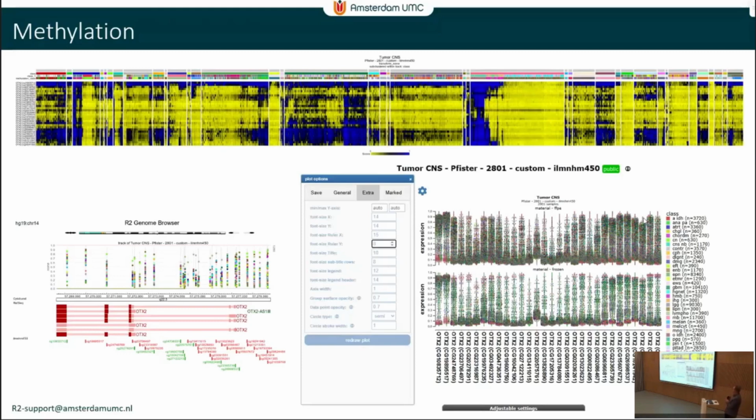So these are typically things that you don't really look at from a one probe or one reporter perspective, but where you actually want to take into account how the methylation property is before or after a particular CpG island. So for this we have heat map visualizations where the order of the genome is instructed, and where you can have a look at the methylation status of this particular region, and subgroup by diseases or by disease states, and in that way inspect the different patterns, which is also automatically linked back to the genome, so you can immediately see on average how things are affected.